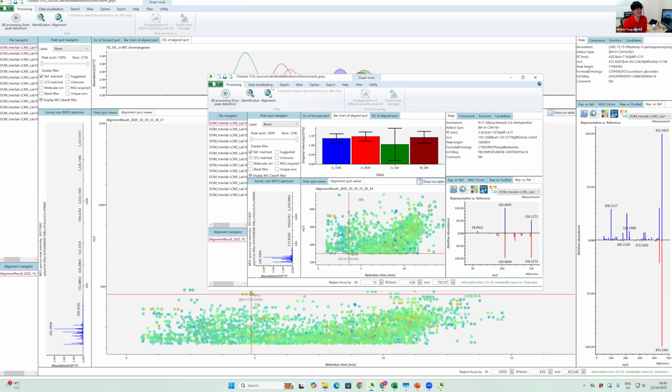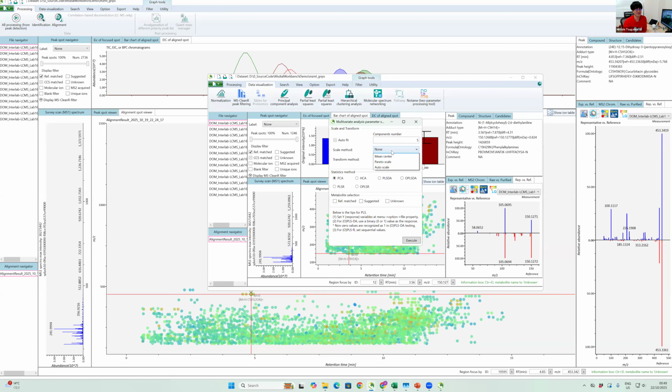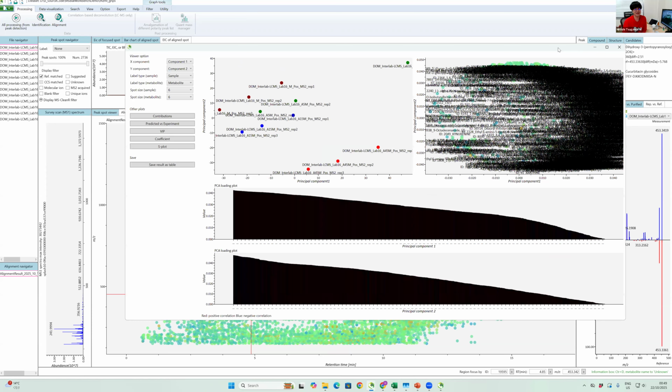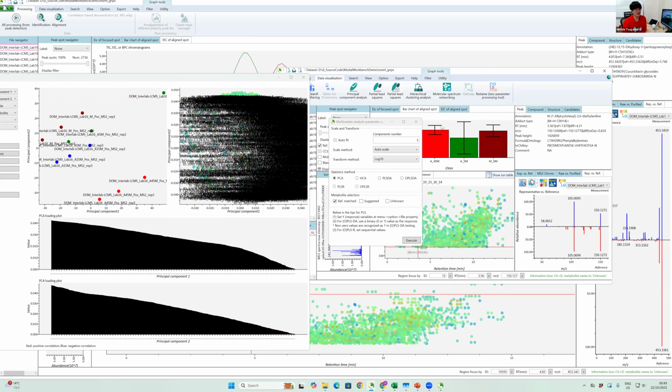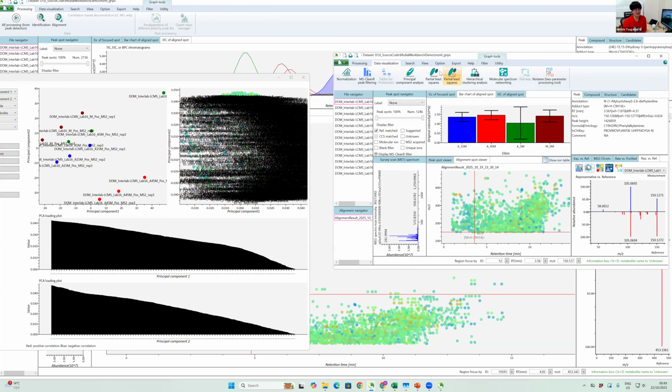Actually, in this MS-DIAL program, you can do, for example, principal component analysis this way. See here. But anyway, what I'd like to mention in this talk is, after data curation is finished, maybe you can normalize your peak height using internal standard compounds, something like this.